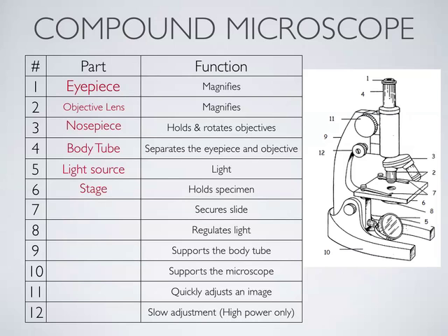We learned about a stage last year. Microscopes? Yes. Okay. So yeah, that's the stage. And then you have to hold the slide on there somehow. Now this microscope has two clips that hold it down. For example, in this dissecting microscope, you can see these are called stage clips.